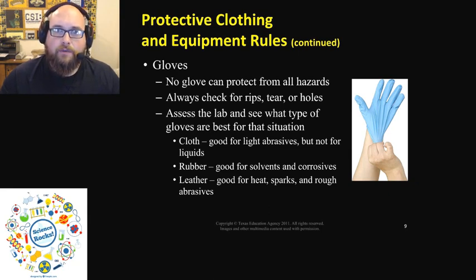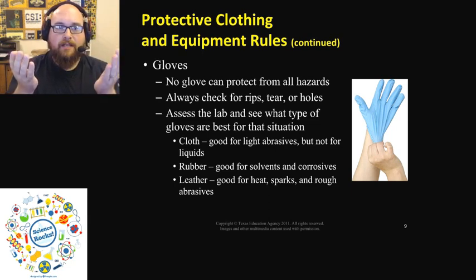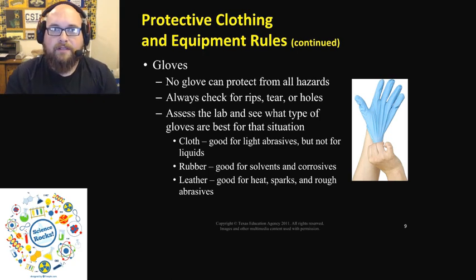Contamination is when one substance comes into contact with another, and then they therefore have mixed. Well, a lot of times in science, mixing of two substances can be a bad thing if they are not what you're trying to do in the experiment or in the activity. So we want to keep those separate as much as possible.